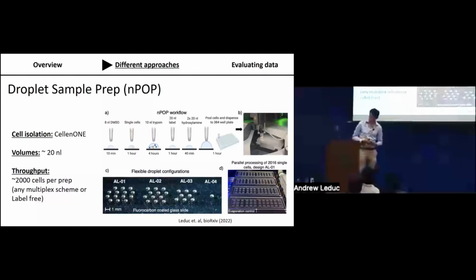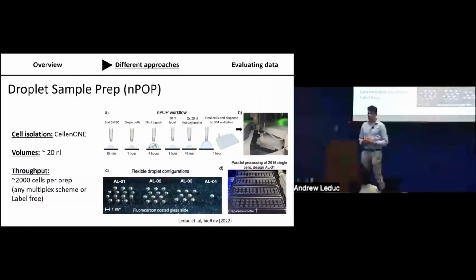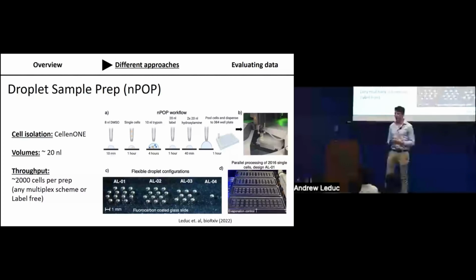Hi, great talk. I'm fully with you on capturing the immunophenotype of your cells as you're collecting them. You probably have a lot of experience with this on the cellenONE now. How well does the flow cytometry part of it work, and are you using it? That's a good question. We've used it minimally. I haven't done any real work to extensively validate this.